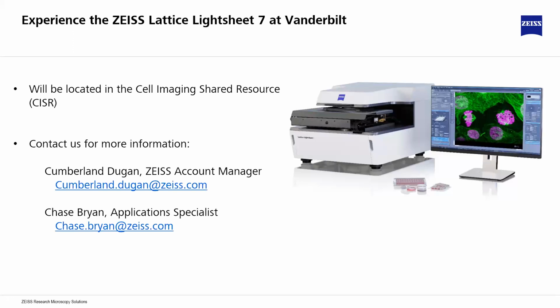So it's accessible in that you can run the system without the lid, or you can run a tube into the sample chamber and have it be a heated chamber, and triggering should be an option as well. So you can add things, but you cannot say, change the media or take something off. Probably you need to flow through. You would need to implement a secondary flow-through type of setup yourself. That's not necessarily baked into the workflow itself, but that is something you could implement as part of this workflow.